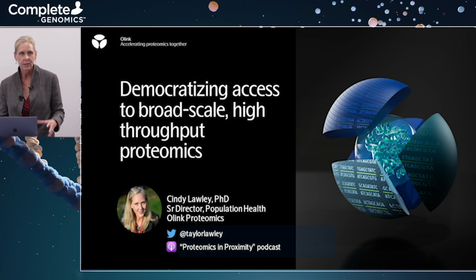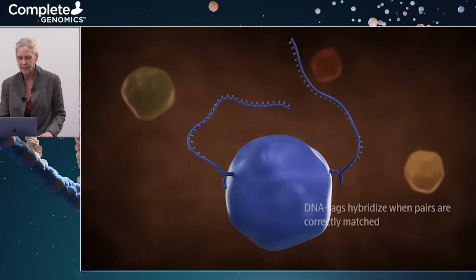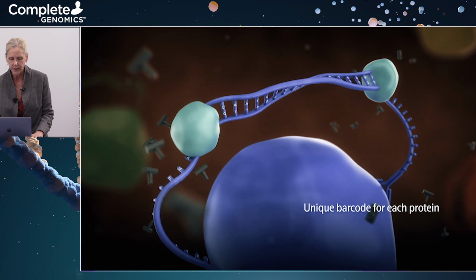So being able to look across the proteome, look at proteomic signals broadly, is an exciting advance in complementarity to mass spectrometry. This is now accessible on the T7, so I'm excited to share a little bit of data and a little bit of application with you today.